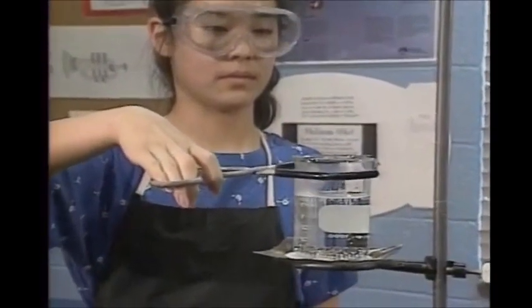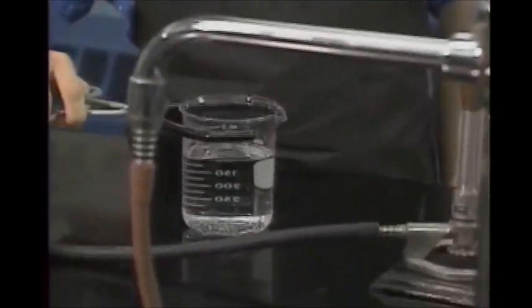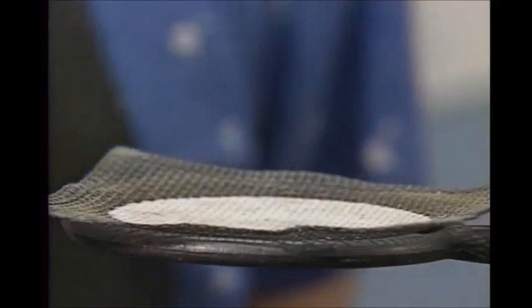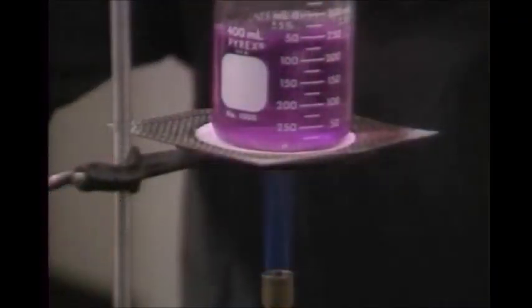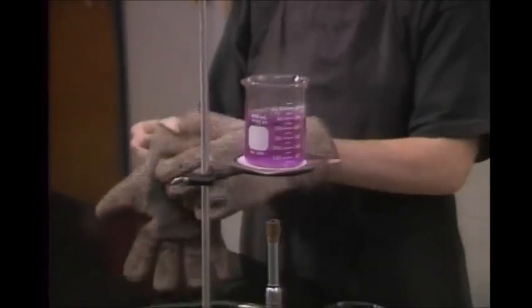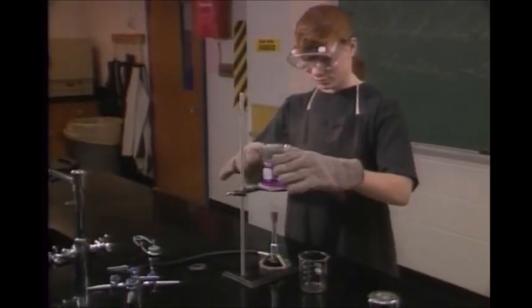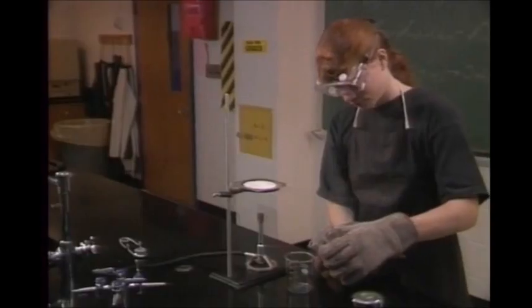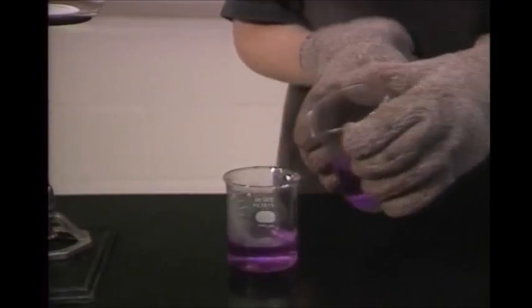Be extra careful when working with heated equipment. Hold hot glassware with beaker tongs, never your hands. Remember that the wire screen and ring stand are also hot. If you don't have tongs, protect your hands with gloves designed for hot glassware. Keep them away from the flame. Handle everything as if it's hot if you've been using a Bunsen burner. Glass and metal look the same when hot as they do when they're cold.